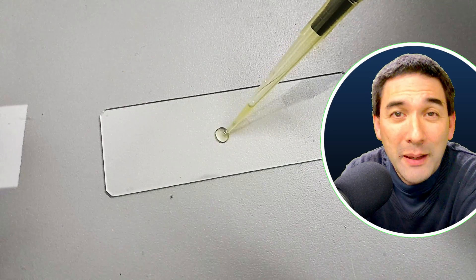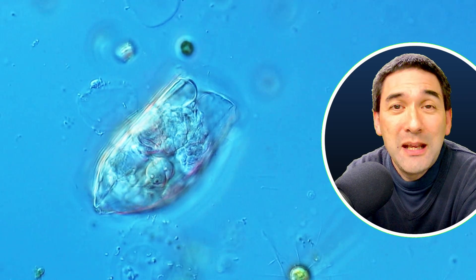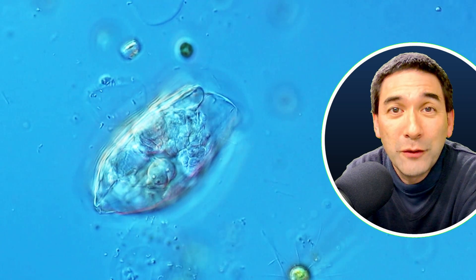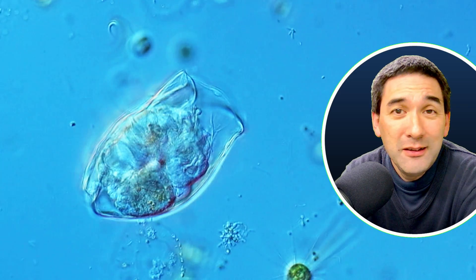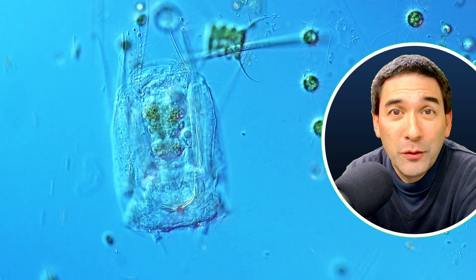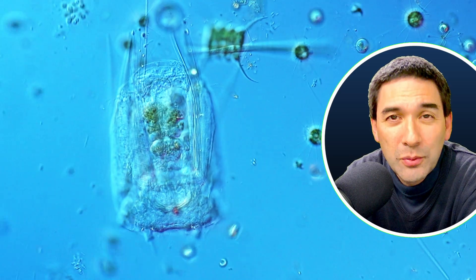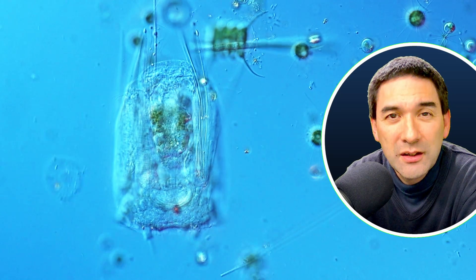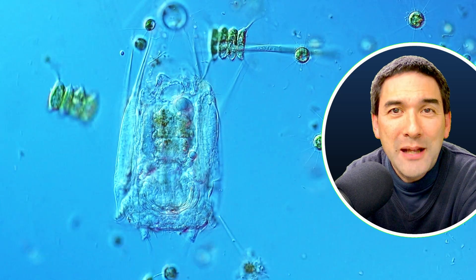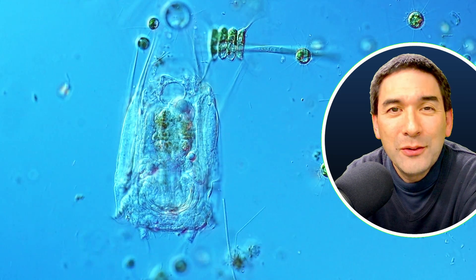A small drop goes on the microscope slide and then a cover glass on top, and then everything went under the microscope. And to my surprise and my delight, I was able to see a so-called rotifer still alive. Evidently, it did survive the high G forces of the centrifuge. And this is another one over here. You can see that there is also some water streaming in because I added a little bit more liquid, so it was drawn beneath the cover glass by capillary action, and this causes the streaming of the water. And the rotifer was also quite happy here, using its cilia to move the water around and feeding itself.